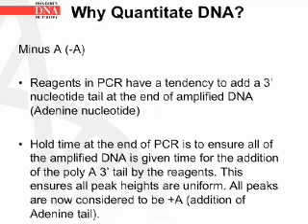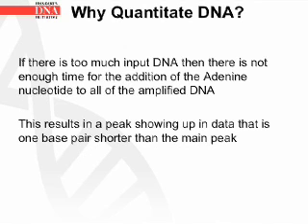Now let's talk about minus A. Reagents in PCR have a tendency to add a 3' nucleotide tail at the end of amplified DNA — this is the adenine nucleotide that is added on. The hold time at the end of the PCR is to ensure that all of the amplified DNA is given time for the addition of the polyA 3' tail by the reagents. This ensures that all peak heights are uniform. All peak heights are now considered to be plus A because of the addition of the adenine tail. If there is too much input DNA, then there is not enough time for the addition of the adenine nucleotide to all of the amplified DNA. This may result in a peak showing up in the data that is one base pair shorter than the main peak.